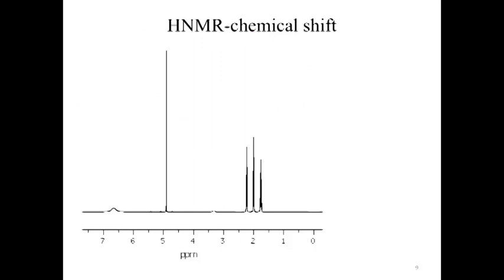So for sure, I've got one out on the periphery, and I've got one here, and then we've got 3 up here. So we've got 5 distinct signals within our spectrum, which means 5 unique hydrogens, and we can now convert that information across. So what I see is something maybe 1.9. I see a signal at 2, 2.2, 5, and 6.5.